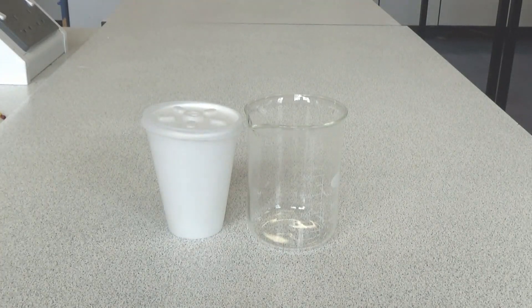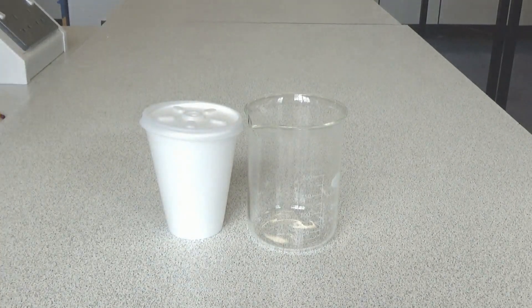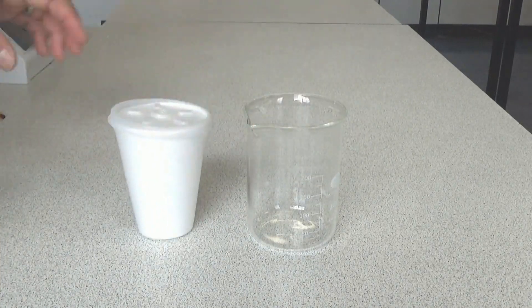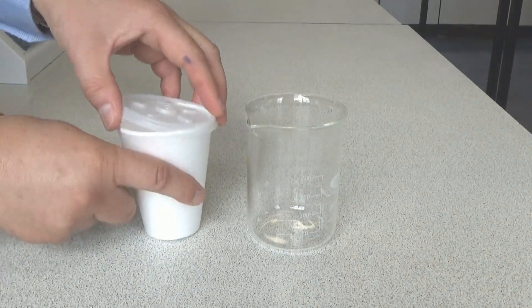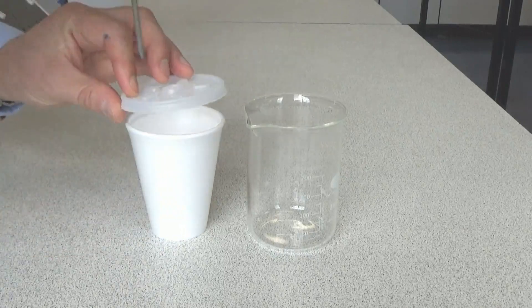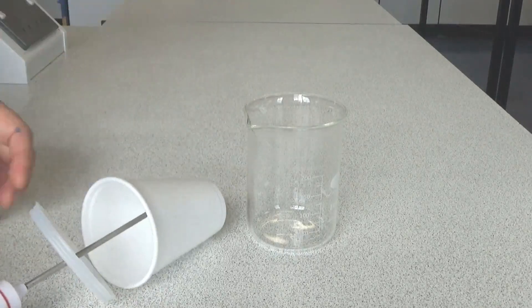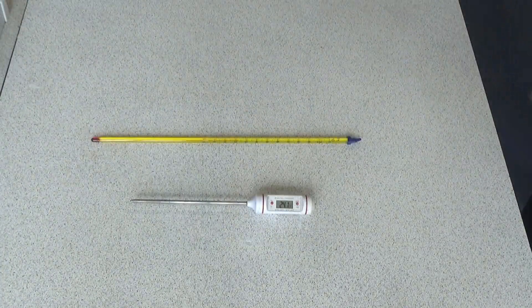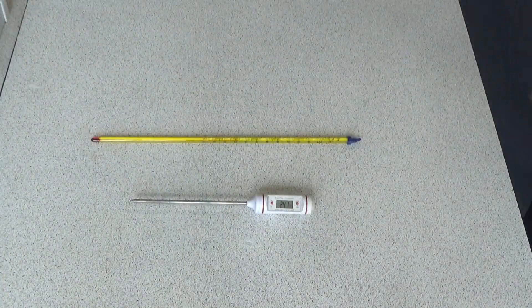I've also got a 250 ml beaker to stand the cup inside to stabilize it. Otherwise when you try and stand a thermometer inside the cup, it will fall over and spill all the reactants inside. We also need a thermometer to measure the temperature change.